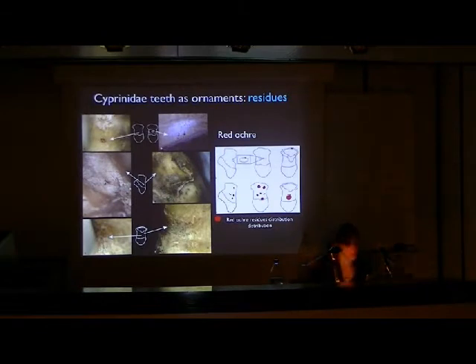And as we said, we were lucky enough to find residues, and actually I have to be ashamed to be honest, saying that at the beginning I was not reading papers very carefully about the suggestion. The first samples that I was studying, I was trying to clean them, and as soon as I tried, I understood under the microscope that the residues were there, and little spots of ochre. At the beginning it seemed like only little spots of ochre, and then actually residues were plenty. So a little bunch was washed, but the rest was analyzed just as it comes from the excavation.